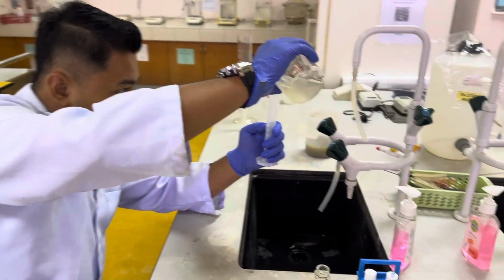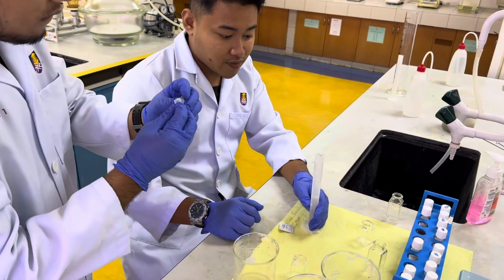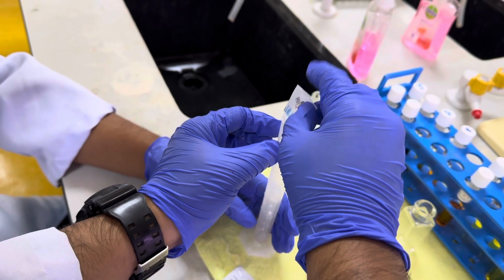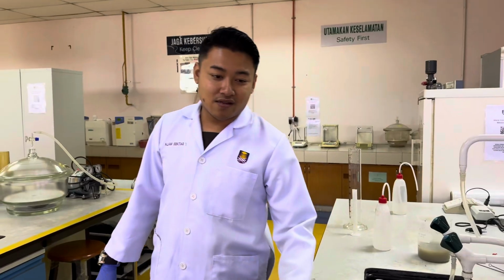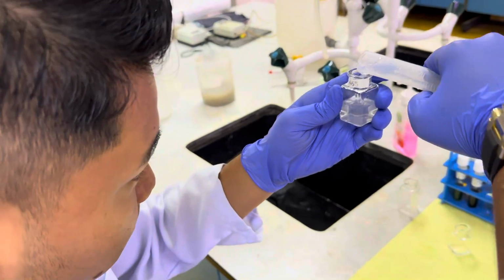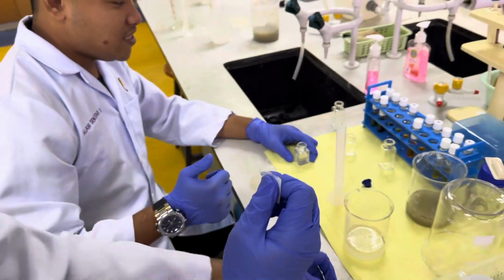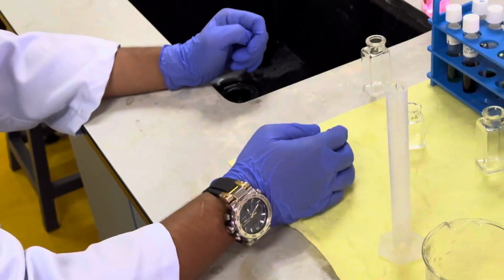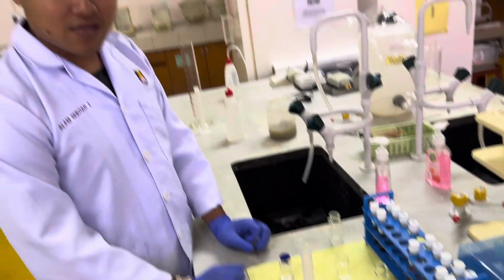In the meantime, we can prepare for nitrate test. Fill a mixing cylinder with 15 ml of water sample. And then, add the reagent and shake for 3 minutes. After 3 minutes has passed, a 2-minute reaction period will begin. After 2 minutes, carefully pour 10 ml of sample into a clean square sample cell. And then you can add a nitrate reagent powder pillow to the sample cell. And then cap the sample cell and shake for 30 seconds. After that, let it rest for 15 minutes.